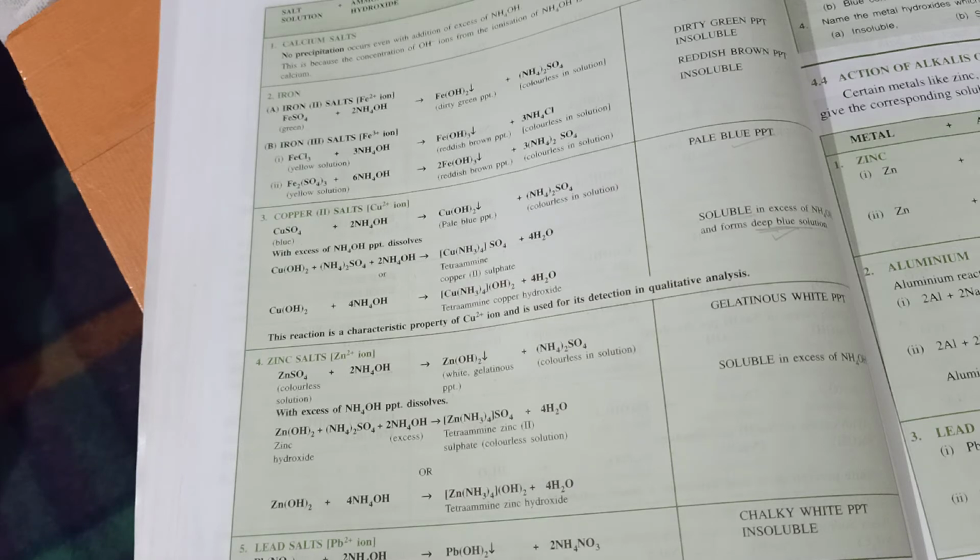For example, suppose we use sodium hydroxide to distinguish between calcium salt and lead salt. With the characteristic of the precipitate formed and its behavior with excess alkali added, we can distinguish between two given metallic salts.